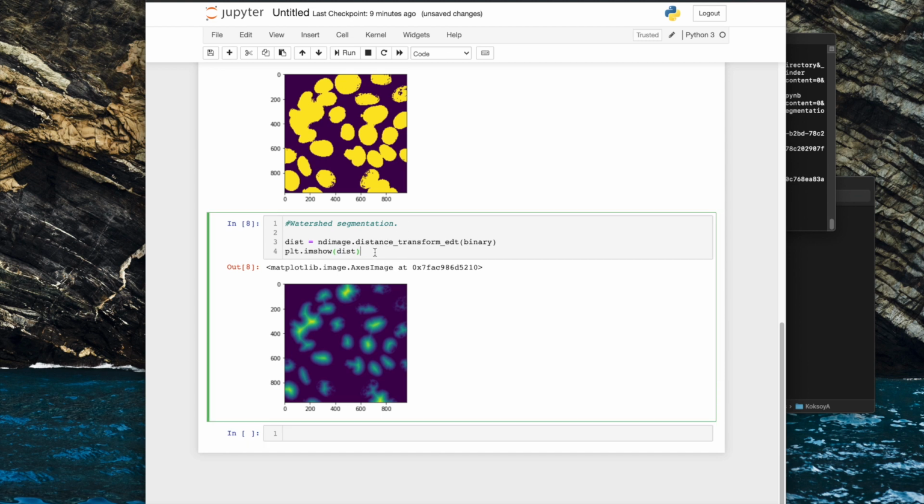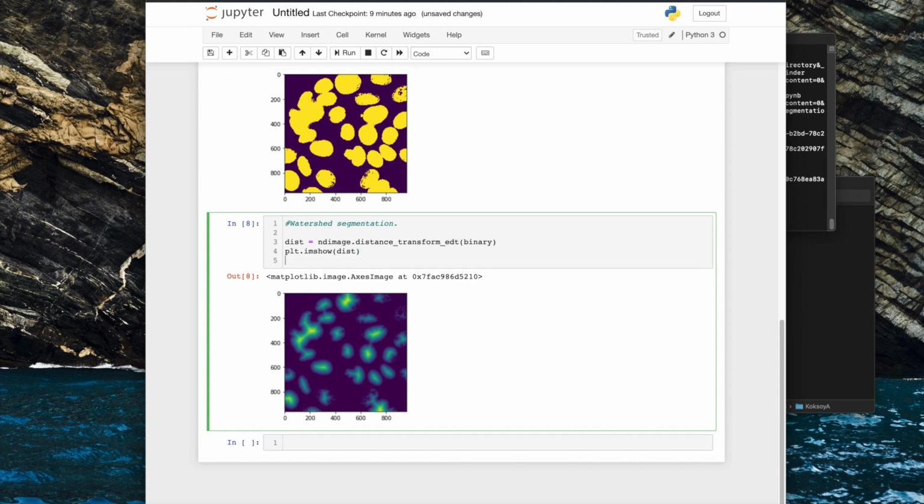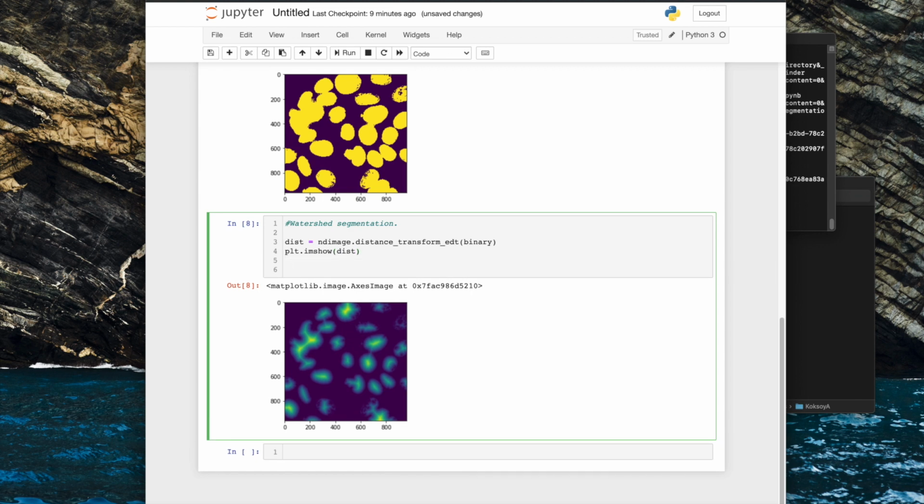Now, to do that, I mentioned that I would use the same maxima finding algorithm which I'll use later. This is a neat algorithm which I wrote in Python, but I've taken it from someone else who originated the algorithm in Java, and I've applied it in Python. So I use this a lot for finding local maxima in an image. This isn't a global maxima, this is bright blobs in relation to surrounding pixels in an image, and it has one parameter which is a noise tolerance, and I'll set that to 15.